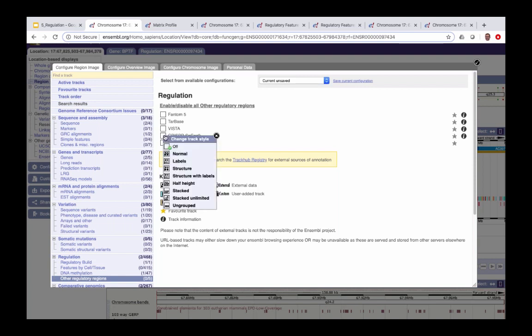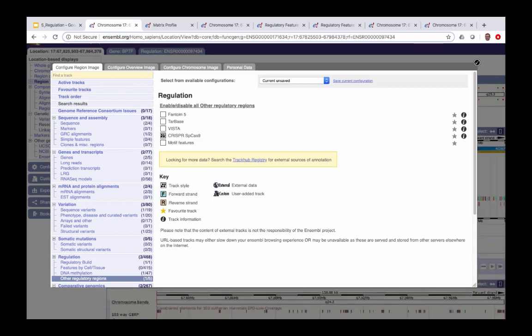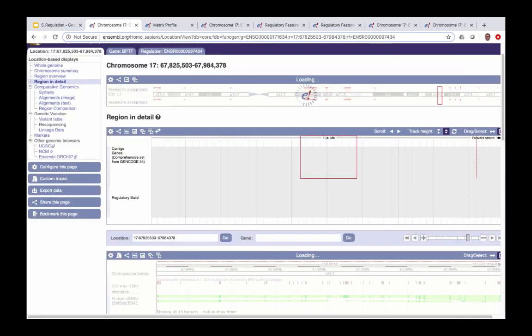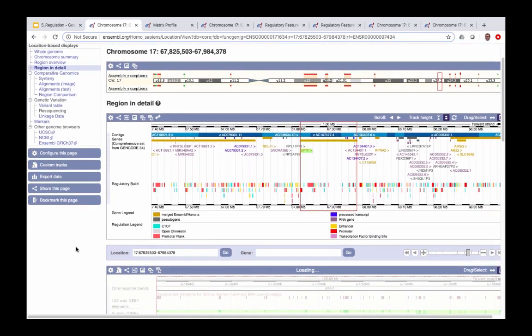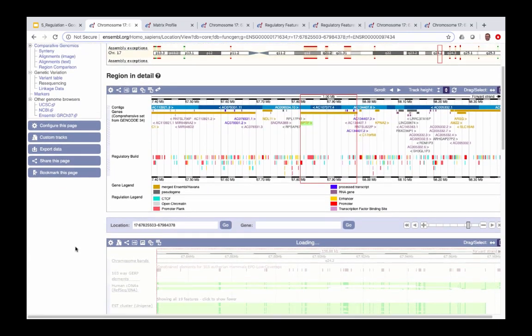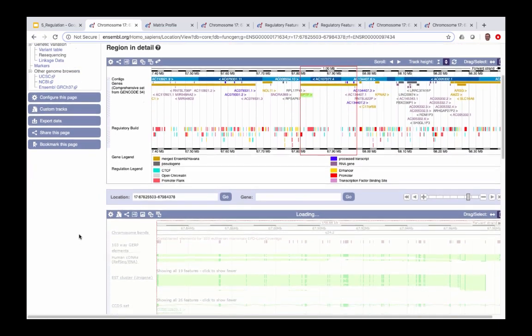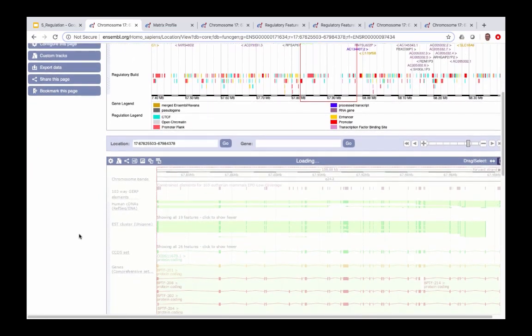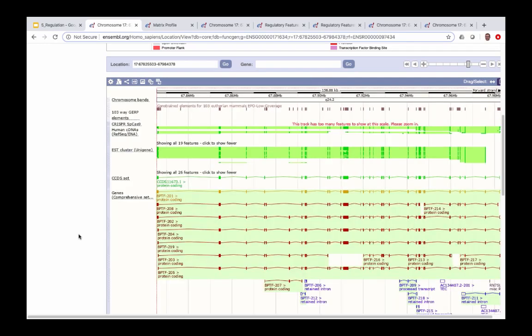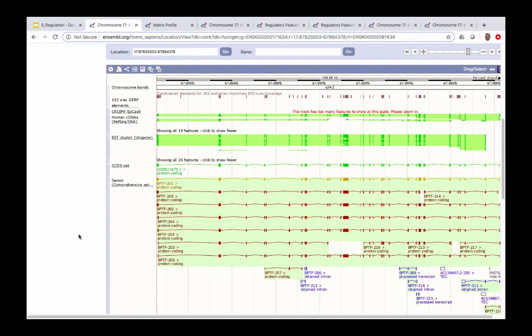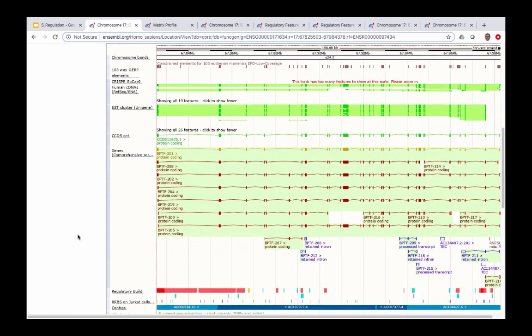The CRISPR-SpCas9 track shows the NGG PAM motifs that exist across a region in the genome, helping you to design a CRISPR experiment by predicting the guide RNA sequences you might need. We can turn this track on and select 'Normal' as the format, then save and close.